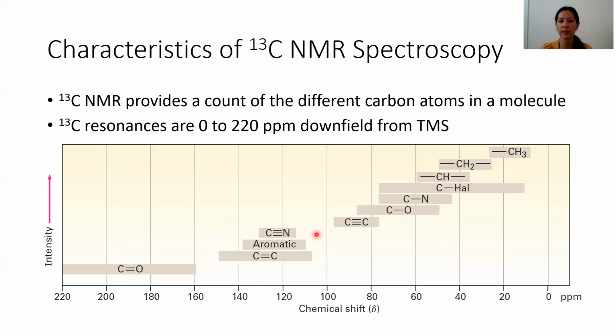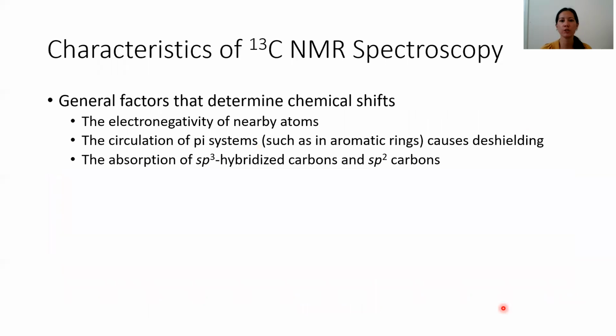This region here will indicate you have aromatic carbons or just alkene carbons. Nitriles will come up here too. Further upfield is the alkyne. And then in this region there's a lot of overlap. But if you suspect you have a C-O, either an ether, an alcohol C-O, or an ester off of a carbonyl group, you better be looking for something in this range, 60 to 80 usually. And then more of your saturated carbons are going to be upfield in the 20 range.